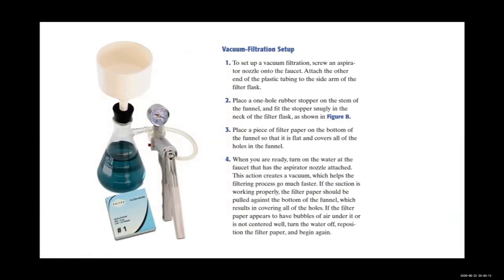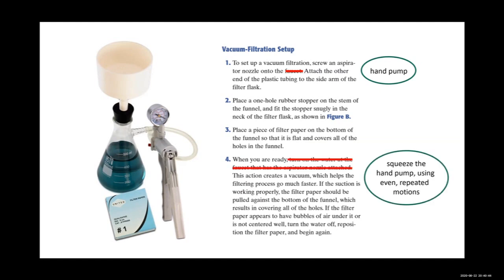To set up vacuum filtration, attach an aspirator nozzle onto the hand pump and connect the other end of the plastic tubing to the side arm of the filter flask. Place a one-hole rubber stopper on the stem of the funnel and fit it snugly into the neck of the filter flask. Place a piece of filter paper flat on the bottom of the funnel, covering all the holes. Squeeze the hand pump using even repeated motions to create a vacuum. If the filter paper has air bubbles under it or is not centered, reposition it and begin again.